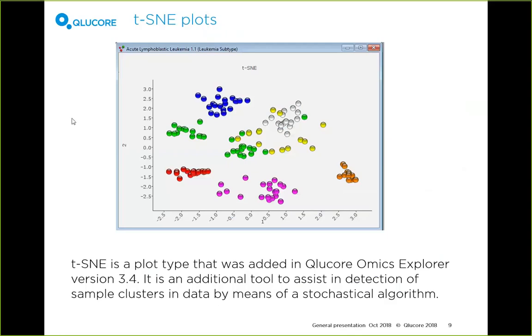Sorry. And t-SNE is a method that is stochastic, which means that it is somewhat chaotic in terms of the fact that if I have a start state for t-SNE and a very close but different start state, they can end up with very dissimilar end states. Although it is a stochastical algorithm, I must also state that it's not at all random, because the same preconditions will give rise to the same t-SNE plot at the end.